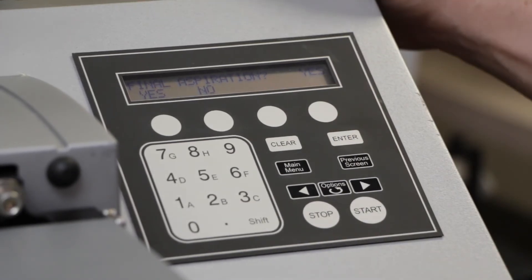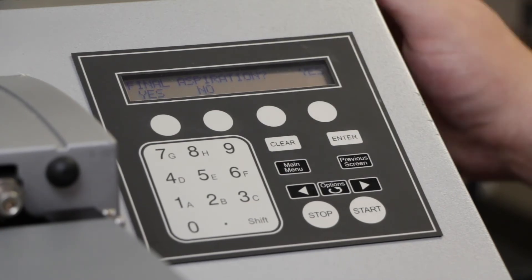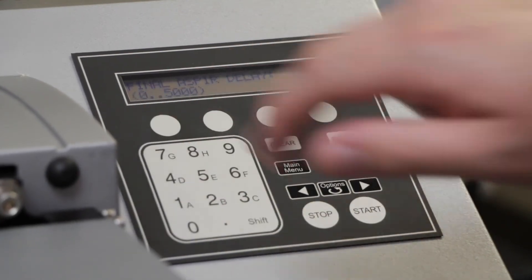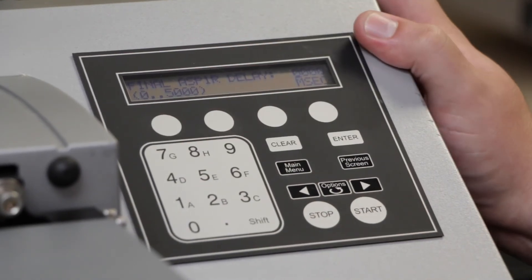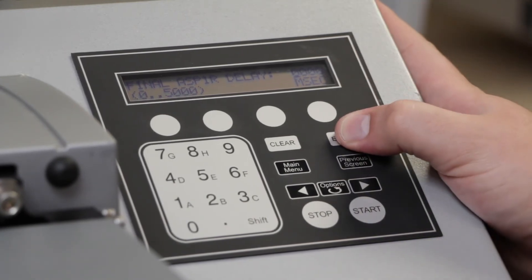Final aspirate asks if you would like to end your protocol with an aspiration. If you want to leave each well full of whatever dispense volume you specified, you can select no. If you're trying to clean out your plates, you can select yes. The final aspirate delay is a simple delay before the final step. We won't use this in our protocol.